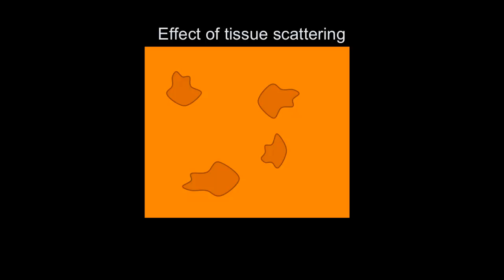Okay, so far we haven't really factored in the effect of the tissue itself. Even if you have no tissue, or the tissue doesn't scatter whatsoever, you still have to work a little bit hard to get rid of out-of-focus light. But now the tissue itself will also introduce some problems, as you probably are well aware of. Okay, so what is going on? If we want to create a beautiful focus inside a tissue, we will encounter several problems.